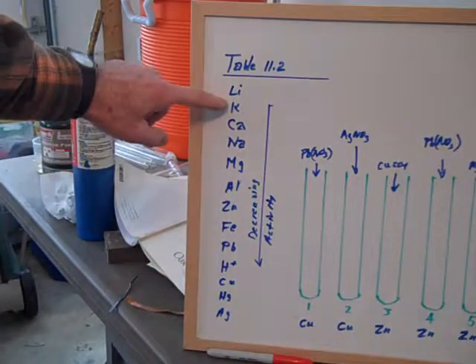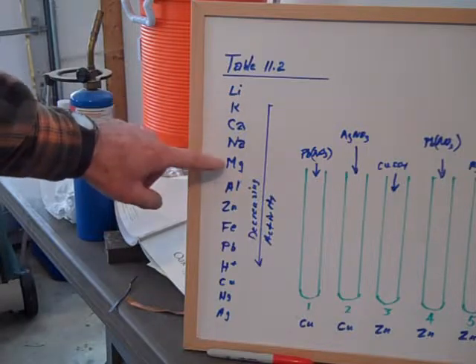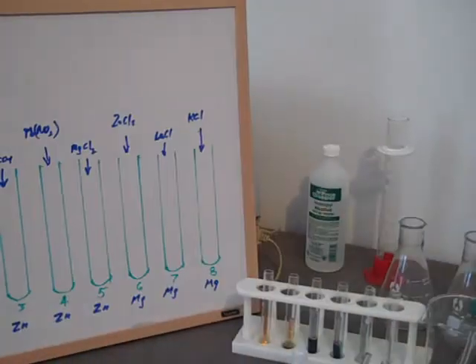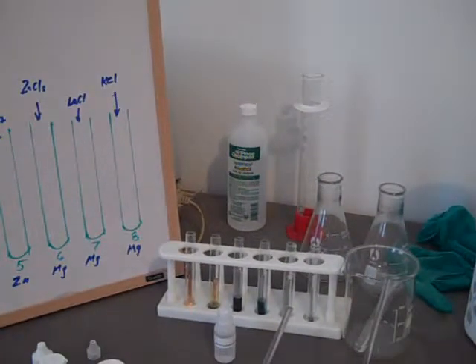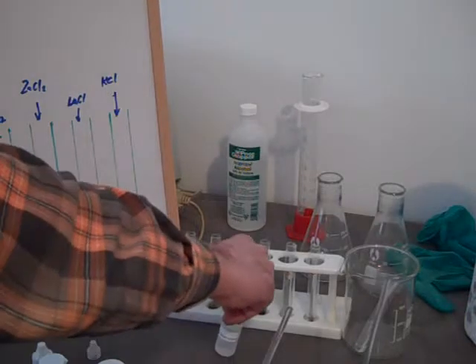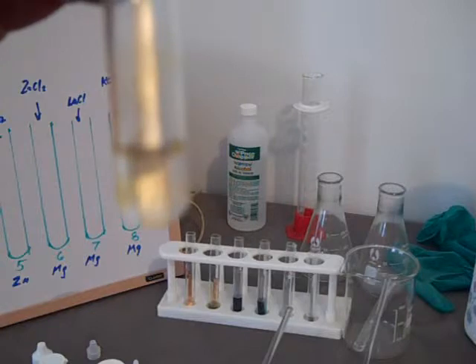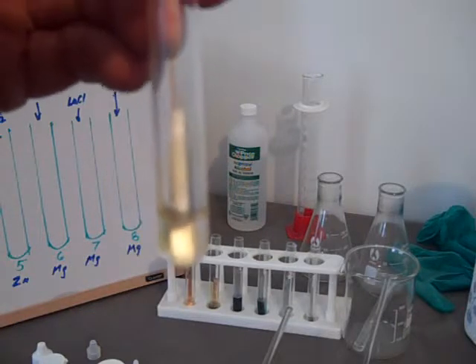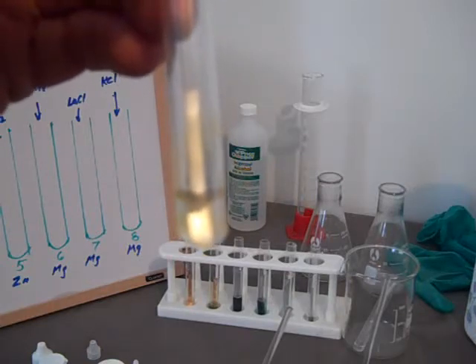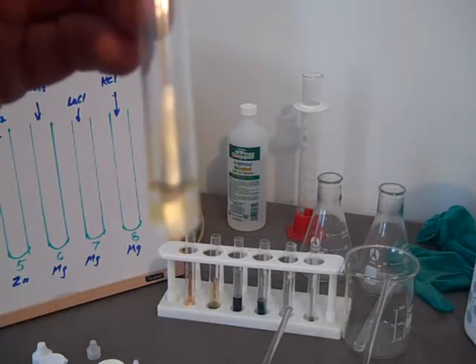And now we're going to try potassium chloride and magnesium. And you can see, again, potassium is way high above the magnesium. So magnesium should not replace or react with potassium chloride solution. Let's see if that's correct. Where is the potassium chloride? Right here it is. Keep track of where these caps are. And I can't see a darn thing happening in there. So as we predicted, this time we were right all the way along. Sometimes we're not on these and we can't understand why. But now it fits our theory. That's always nice.